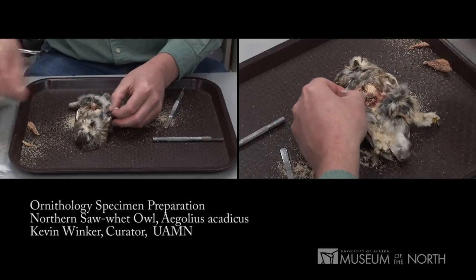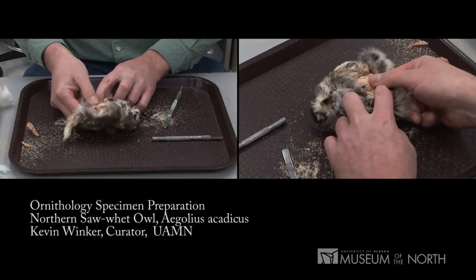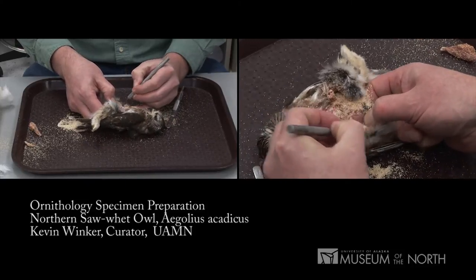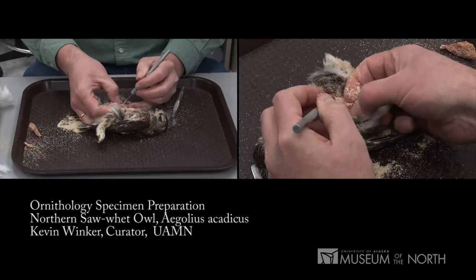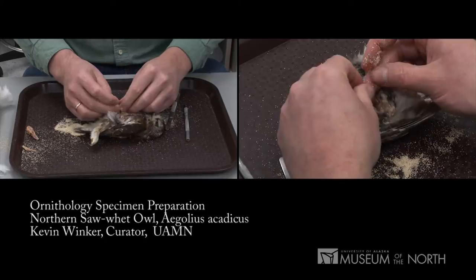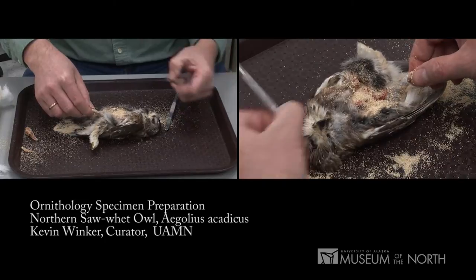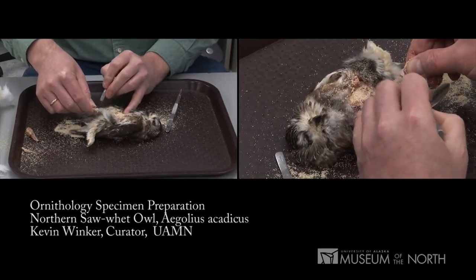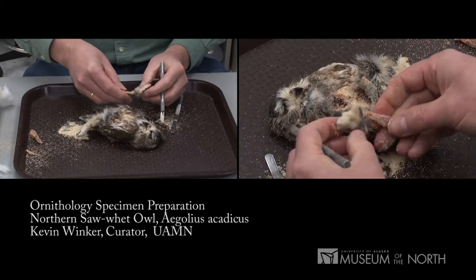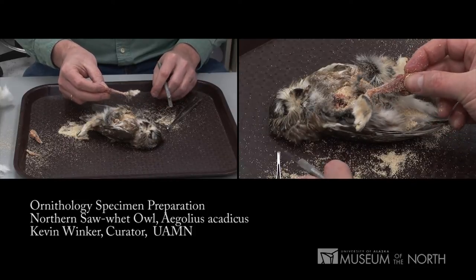I'm going to do the same now with the right side — pulling that knee up, popping it through, making it visible, then disarticulating it. But on this leg, instead of keeping it with the skin, I'll disarticulate it, keeping the juice from getting on the feathers. I simply cut the skin on the inside of that foot and pull the leg completely free. That leg will now be set aside for the partial skeleton, which we'll complete in a moment.